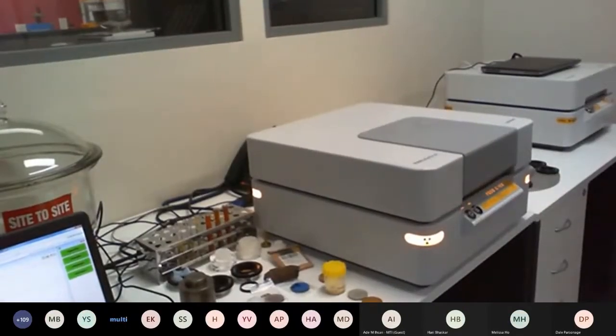Okay. So we've got our results on the screen. Oh, sorry, I've got the wrong display up. Bear with me.